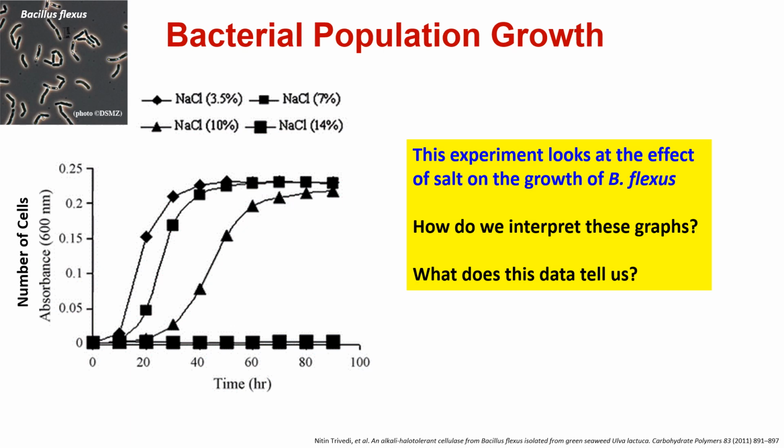Okay, so I'm going to talk about interpreting these graphs using this experiment from this paper, where they watched the growth of Bacillus flexus. And you can see some of those cells here. They look like typical bacilli.